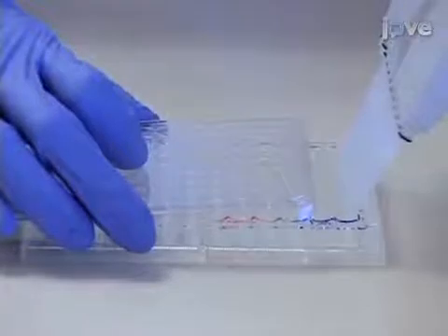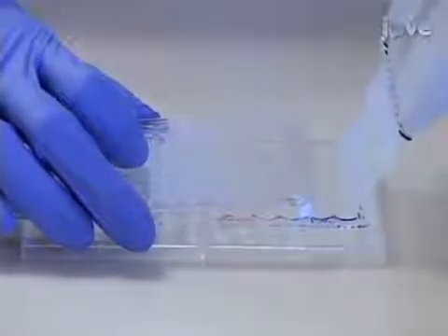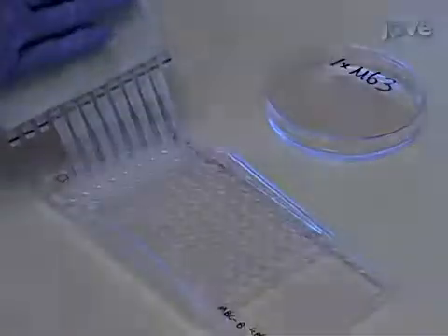Using a multi-channel pipette, remove the spent supernatant that contains planktonic cells. Then add 90 microliters of M63 to all of the wells, and add 10 microliters of the oil.